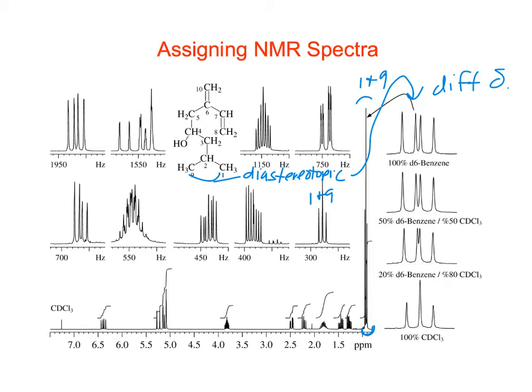Okay, what else can we pick out easily? We thought that one was easy. Yeah, good point. Usually the one that's furthest downfield we should be able to pick out, right? Which proton does that go to? 7, because it's sandwiched between two double bonds. Yep, I'd go with that. It might be based upon chemical shift, but does it fit the coupling as well?